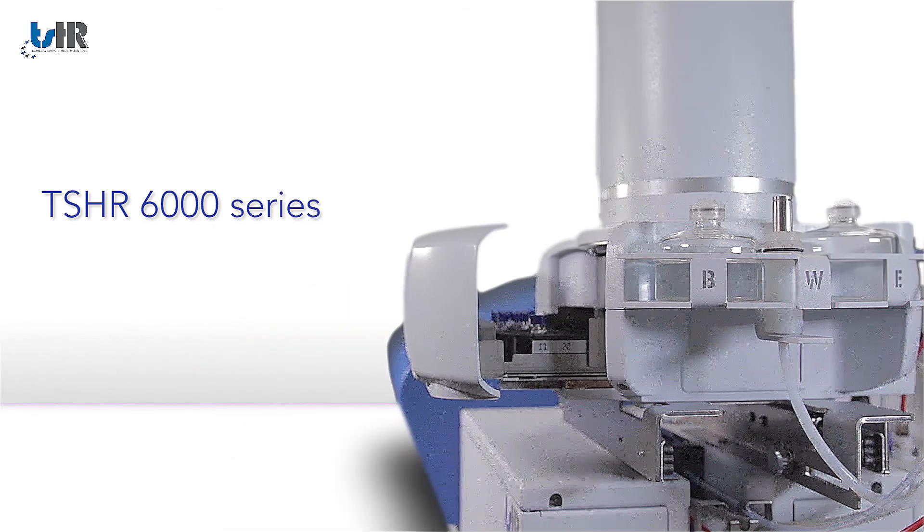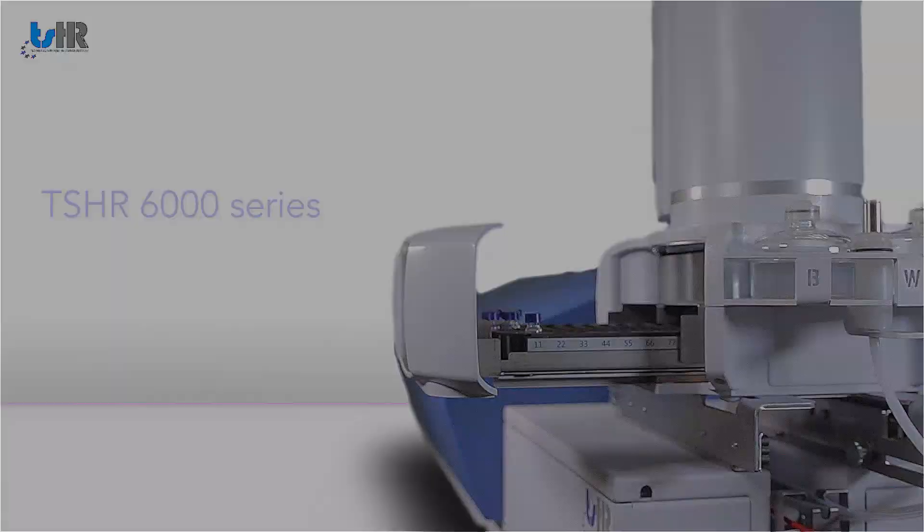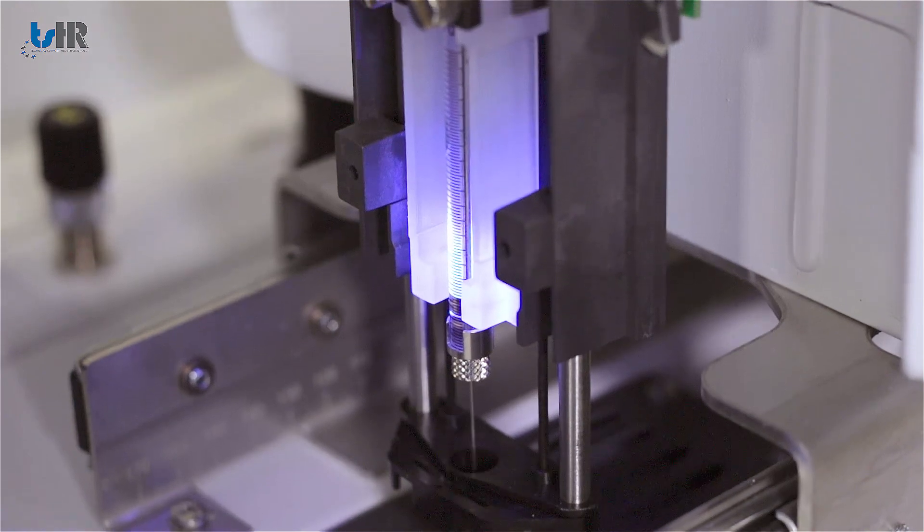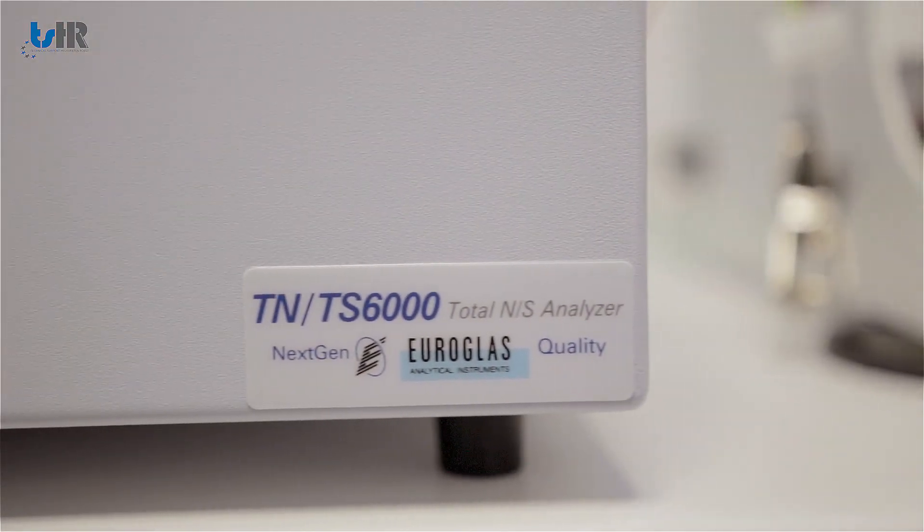The 6000 series is based on horizontal sample introduction and combustion techniques for the analysis of liquids, solids and gases and is the most versatile TNTSTX analyzer on the market.